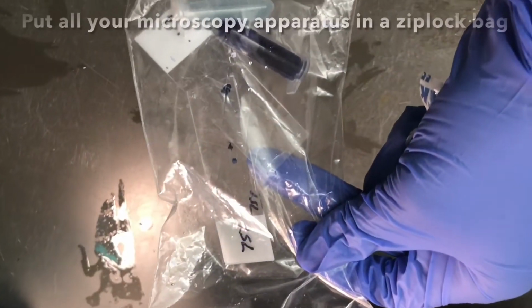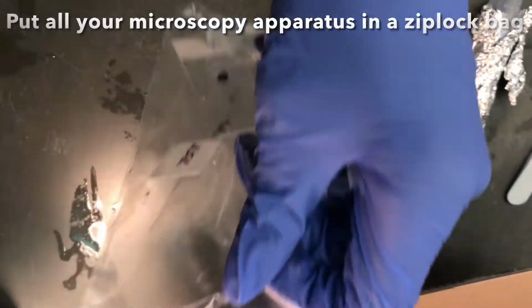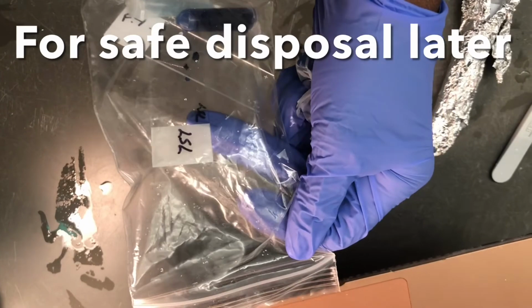So just make sure that everything that you use, like the microscopy materials, you take a Ziploc bag to put them in there so we can later dispose of them.